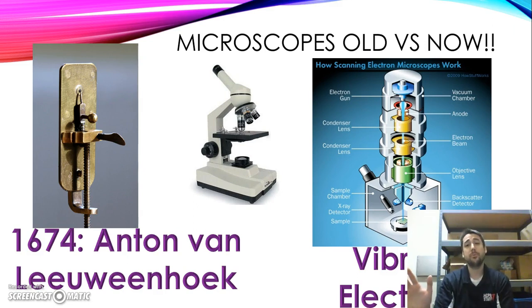If there's anybody you should remember about microscopes, it's Anton van Leeuwenhoek. Leeuwenhoek there in 1674 sort of had a monopoly on microscopes. That was it. It's very simple. You just had basically a bead and a needle for the specimen, and he would hold it up to his eye and was able to see a pretty powerful image, which is very nice. He's kind of considered the father of microbiology at times because he was looking at pond water, bacteria, blood, all these really microscopic things that not a lot of people were able to do. And he kind of kept all those microscopes to himself, or at least the best ones, so that he could make a little bit more money.